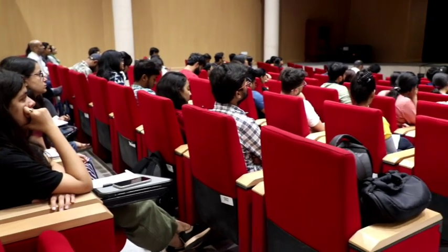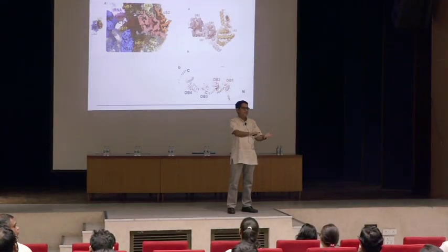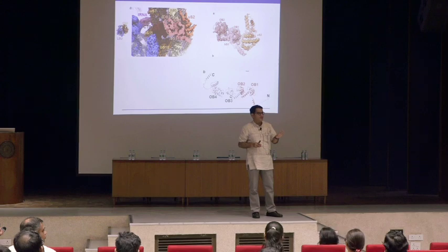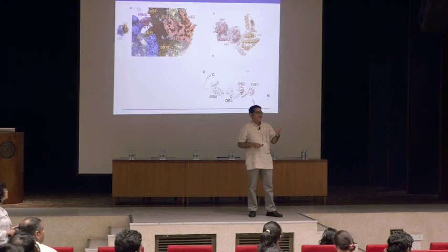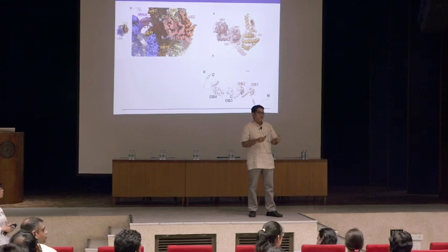You talked about signal subtraction. What was the particular advantage, in terms of resolution or computational speed? You are dampening the background, so you have a better alignment. Computationally, it is not expensive. It works well. But you have to make different attempts. It may not work in one shot, where you subtract and it works.